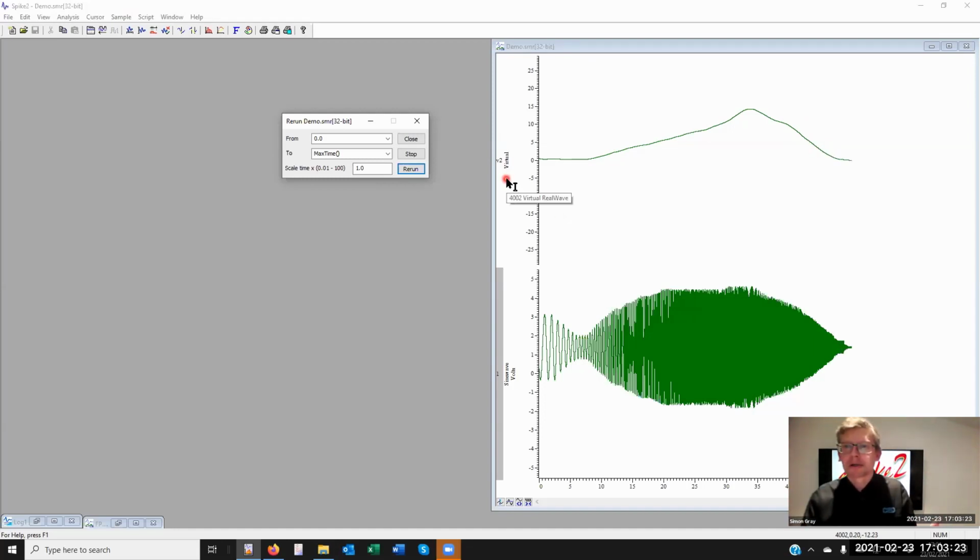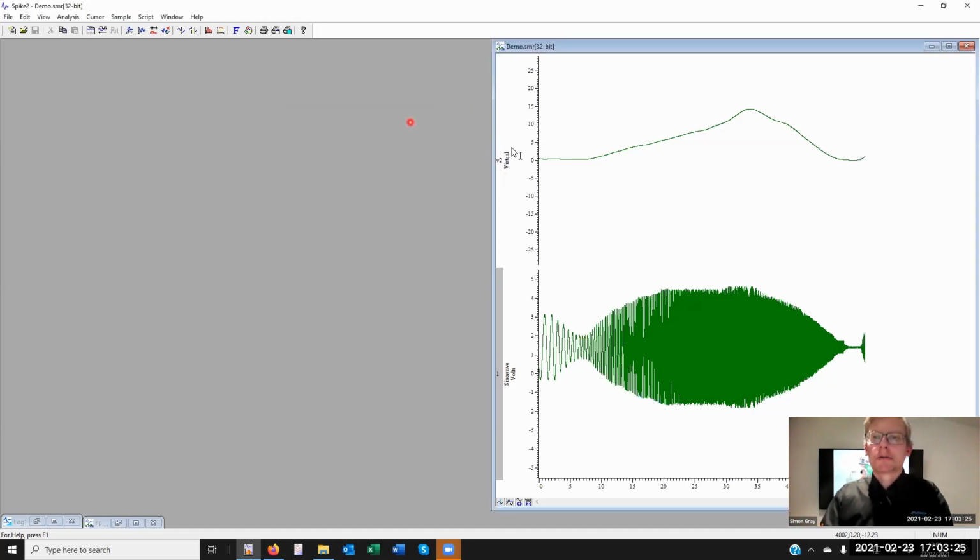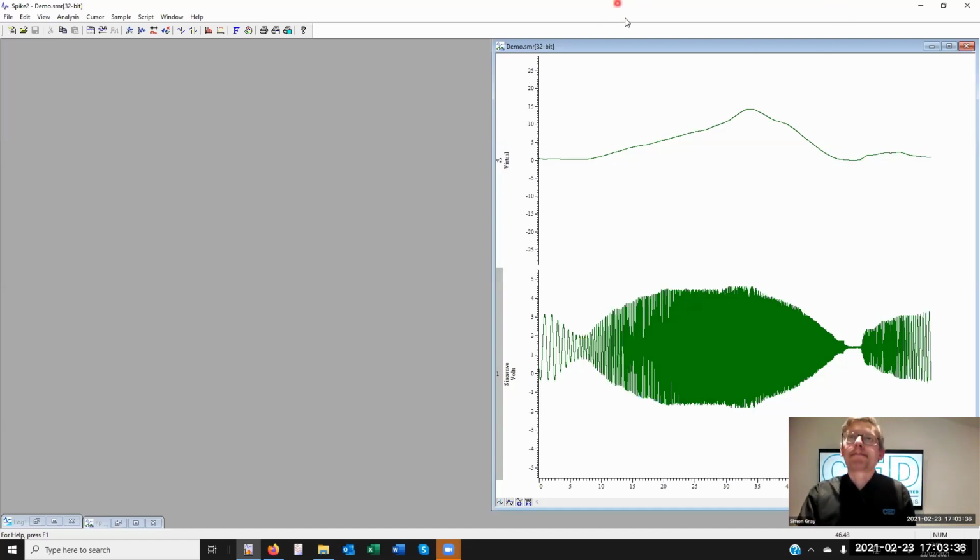Yes, we could go further. I will mention again that active cursors, active horizontal cursors, could be used on this virtual channel because it's another form of waveform.